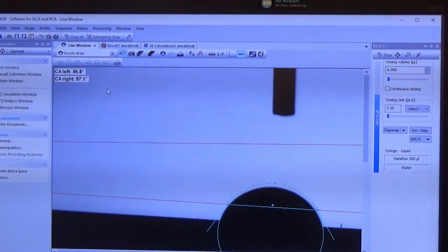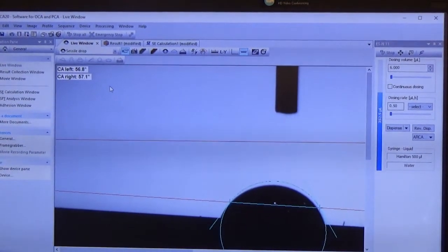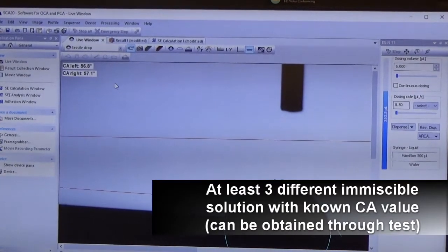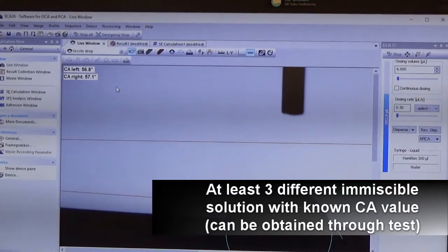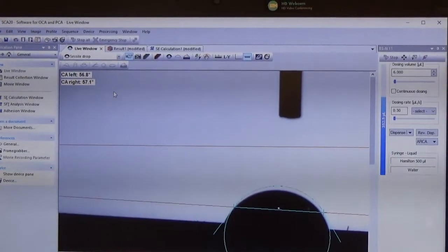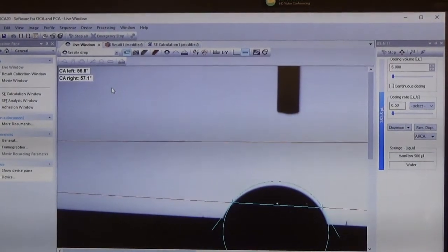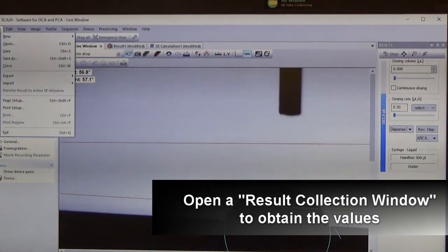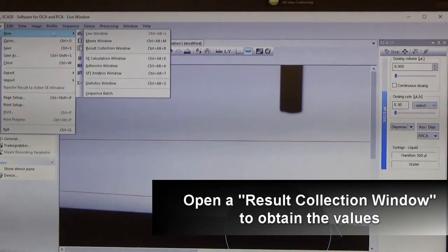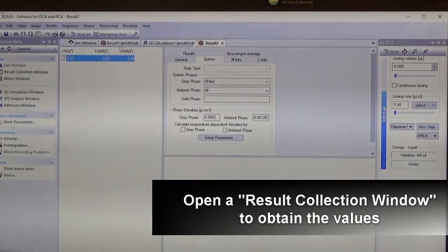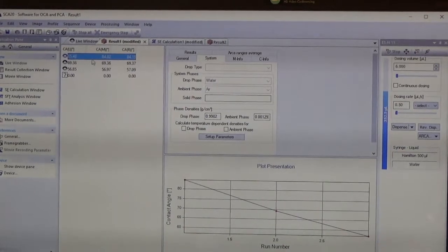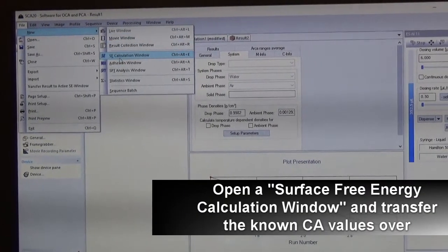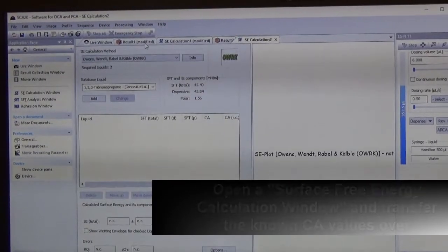Now we are going to show how to get results for surface free energy. For surface free energy measurement, you need three different types of solution and you have to perform the sessile drop measurement on all three solutions on the same solid substrate. After that, open the result collection window to obtain the results for these three different solutions.